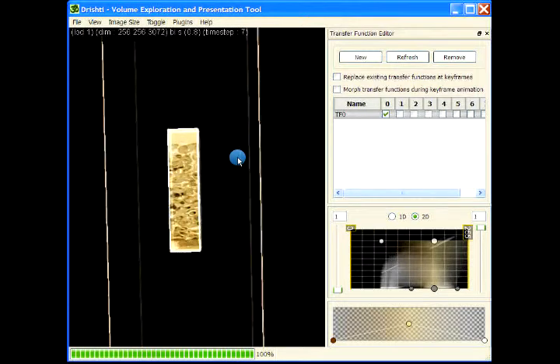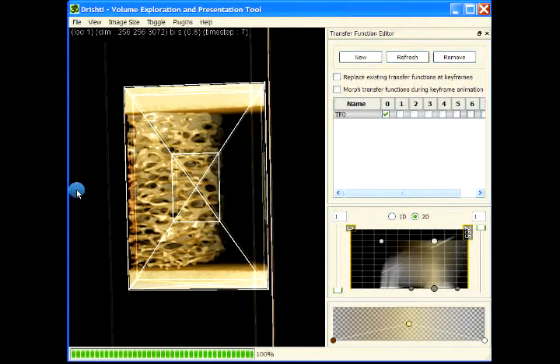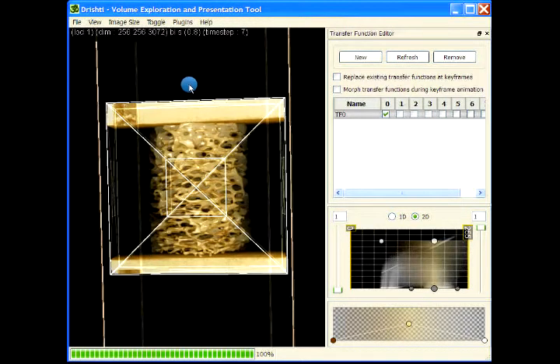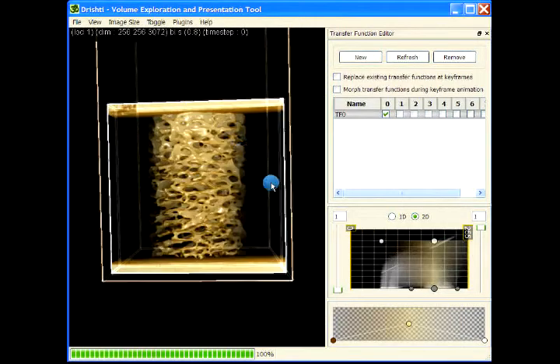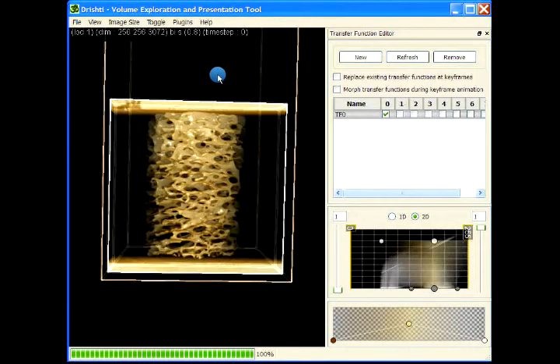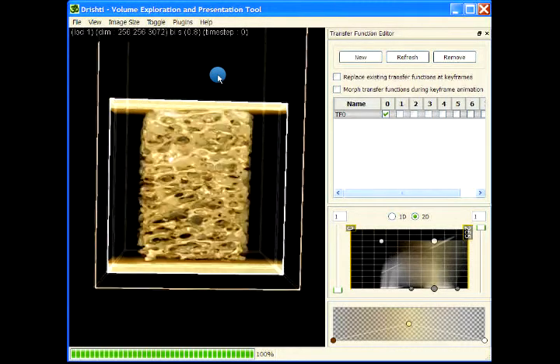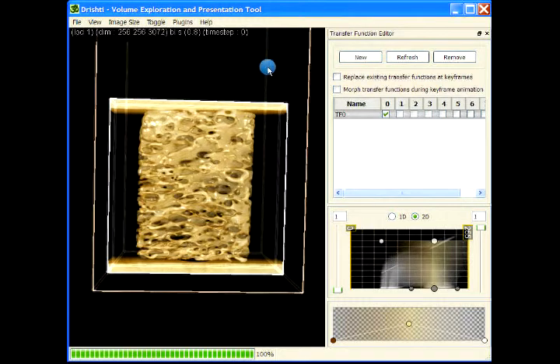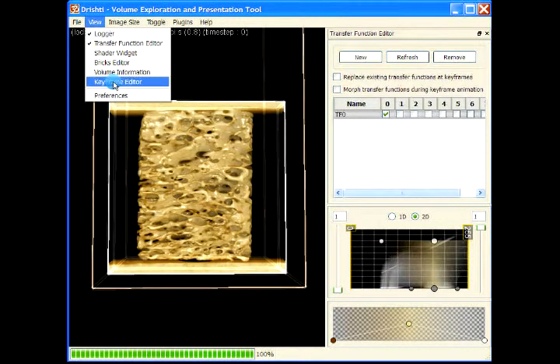Now for example, you want to animate this. Let me just go back and reset the box, and then time step 0, this one here, and then just move back a bit. I'm using the up arrow key to move back a bit. Okay, now I want to do, say, animation.